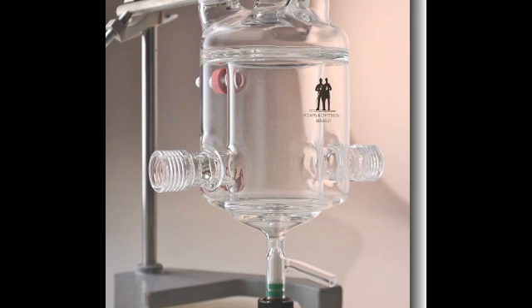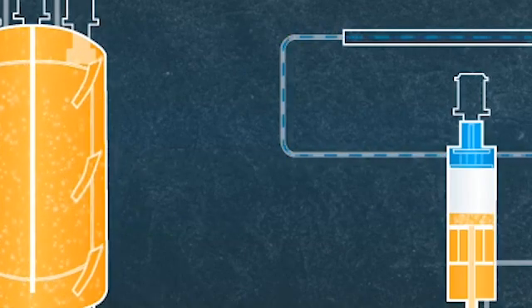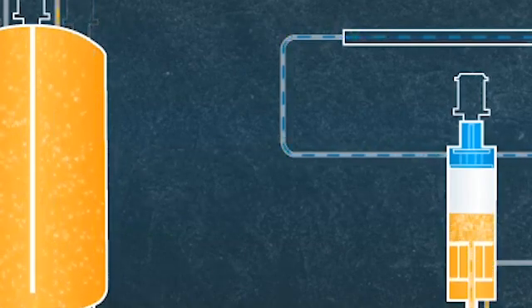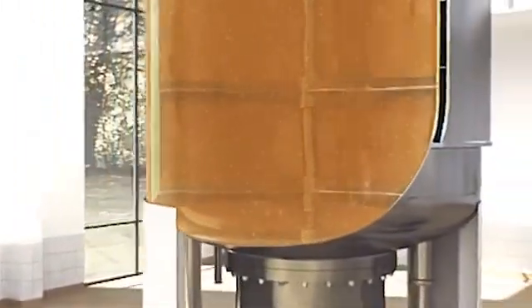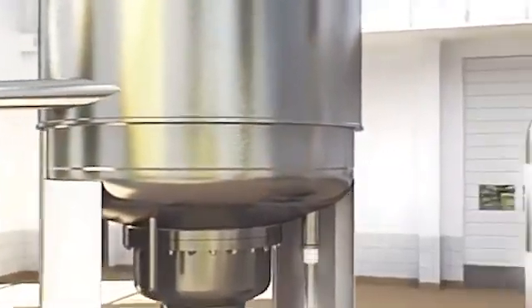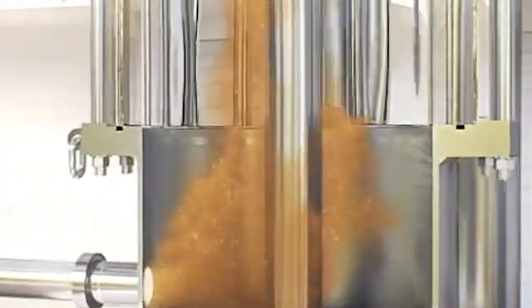Experiments were performed in a 250 milliliter jacketed glass vessel. The crystallizer was cooled indirectly with ethylene glycol. A Lauda RK8KP thermostatic unit was used to cool the ethylene glycol and pump it through the jacket of the crystallizer. The temperature inside the crystallizer was measured with a PT100 sensor connected to the RK8KP. Agitation in the crystallizer was provided by a magnetic stirrer. With continuous experiments, the feed was pumped into the crystallizer.